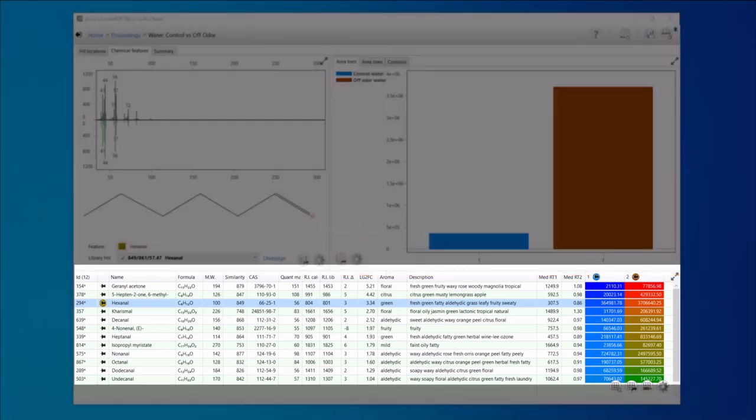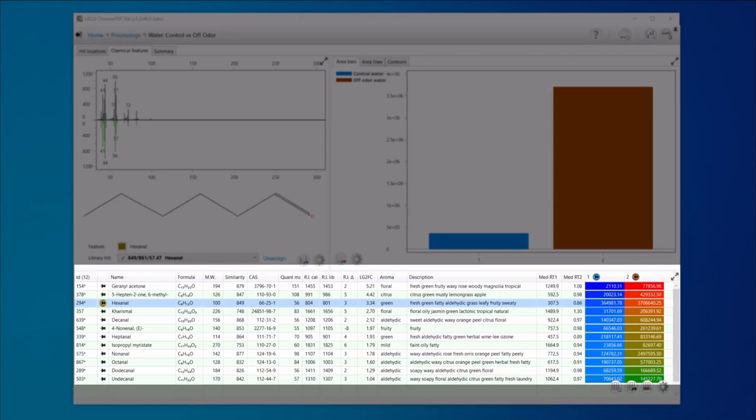Our filter list is showing some of the analytes that are higher in the off odor sample with aroma notes. We can see some interesting information here. Many of the analytes are aldehydes, and we're seeing aroma descriptors like green, citrusy, fruity, sweaty, and so on. Tile helped us focus on the regions of the chromatogram with differences so that we could quickly get to these off odor candidates.